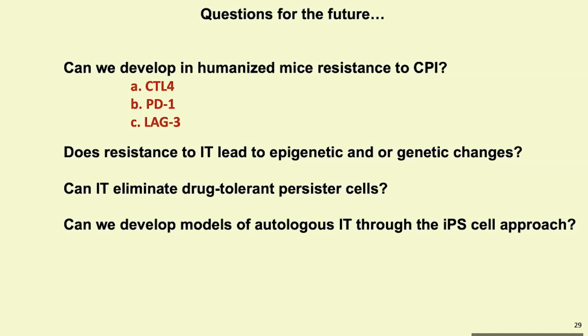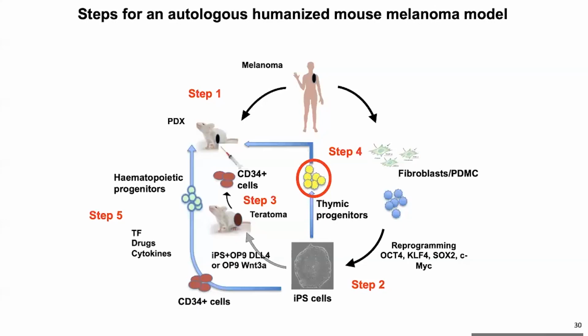And so the final question. Let me give you the final slide there, an experimental slide on our model, how we are seeing the future. And I have to admit, it's a tough future. So we make a PDX, and in melanoma, it's easy because you have a take rate of anywhere between 80 and 90%. And those that don't grow, there's usually a problem in your own laboratory, or there was something with the tumor, and maybe some accidents or anything like that.